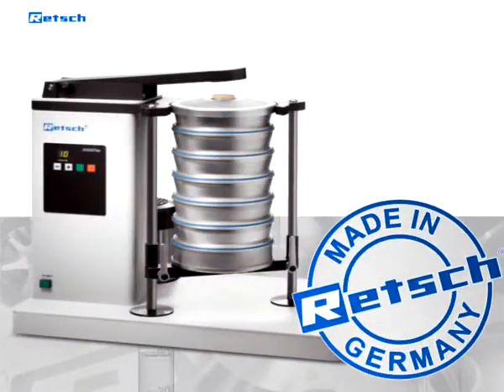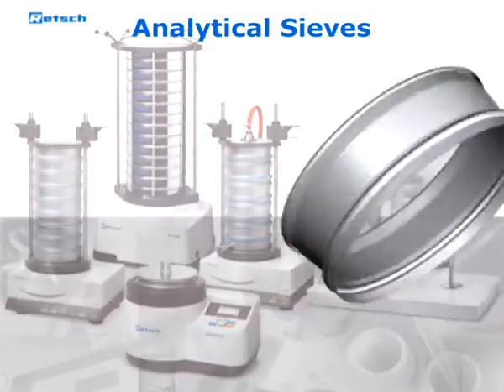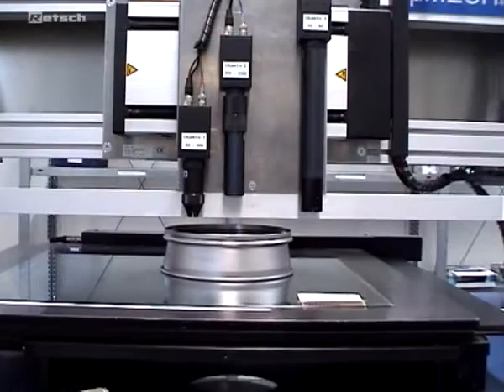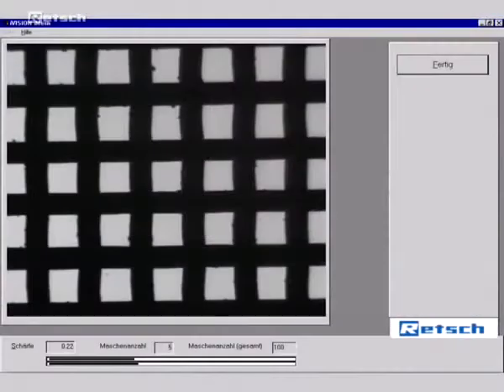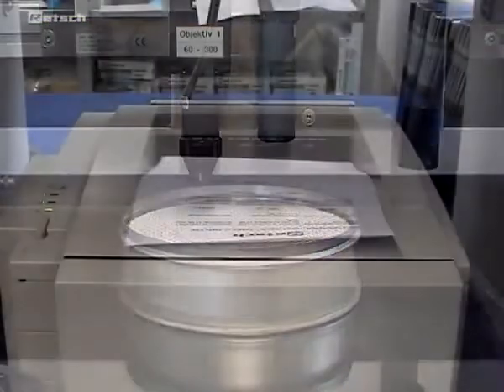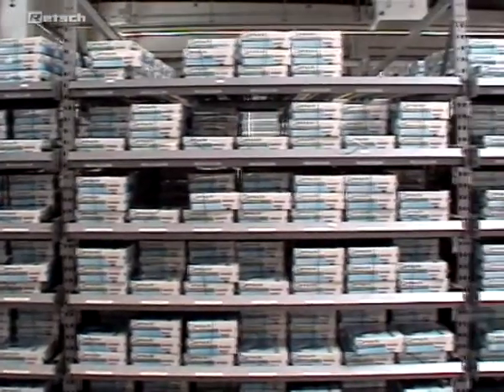Quality made in Germany. In addition to sieve shakers, Retsch also produces high-quality sieves. The fully automated production process and the thorough optical inspection allow for a previously unattained product quality, which is documented by a test report. The state-of-the-art production process guarantees the highest possible quality for each and every sieve.